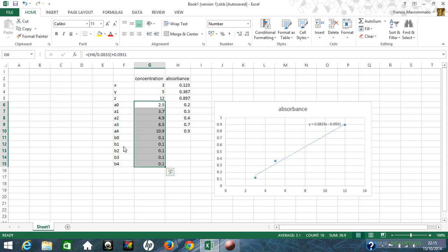If you have any further questions about this, well, tough. I'm happy to help you with biochemistry. This is not biochemistry. This is something that if you know it, you know it, you can use it. If you don't know it, it's not within the scope of this module to cover basic study skills such as Excel. I'm doing my best here to help you with using it, and I think if you put some time into it, then combined with this video, you should be able to pull it off.